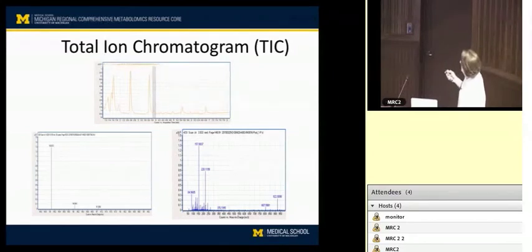And underlying this is a number of different scans. So essentially, time of flight. The ions going down the flight tube are summed together, and then they become a scan. So you can discretely walk through this. In our instrument, it's 0.06 seconds, I believe, for each scan. So you can discretely see what's coming out at any given time.